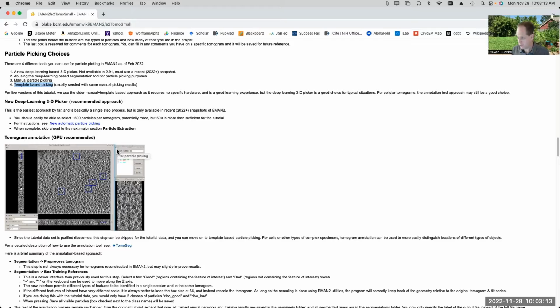However, if you take your high resolution ribosome and you low pass filter it to 30 angstrom resolution, so now it just looks kind of like a blob. It doesn't have any internal features anymore. And then you can reduce the box from 300 down to, say, 32 or something like that. So you can reduce the box size by an order of magnitude. Also, the number of different orientations you have to generate is massively reduced. Now, instead of tilting 1 degree to cause a significant change, you have to tilt like 5 or 6 degrees before you cause a significant change.